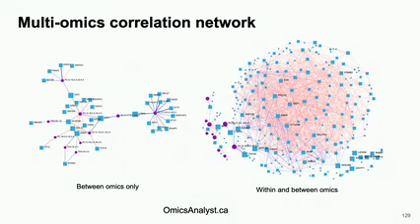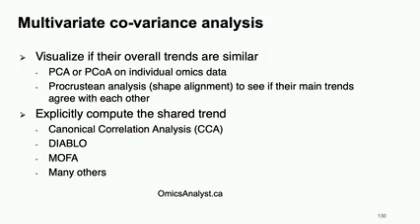And so for us, it's from a data science point of view, and it seems very interesting. But biologically, it's really based on your particular field. So I'm just leaving it to you; we can do enrichment analysis on this network. What I would like to say is you can easily generate an overwhelming correlation network, but a lot of them could be just random. So really you need to control certain thresholds and form something more robust.